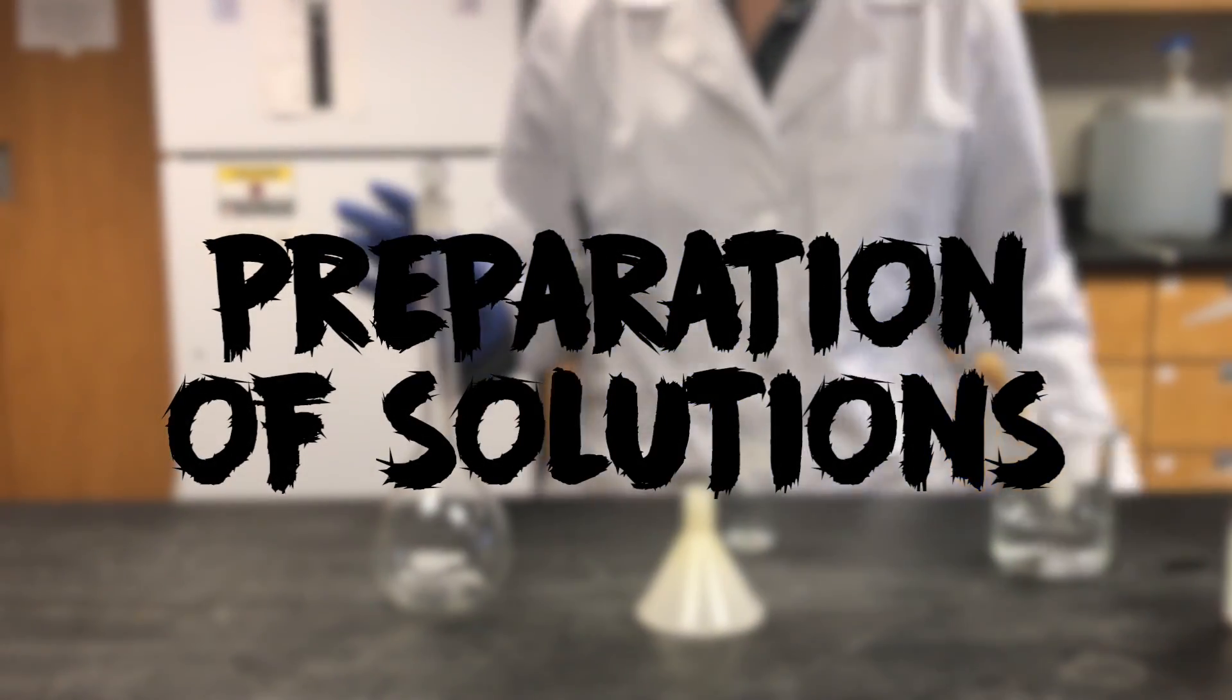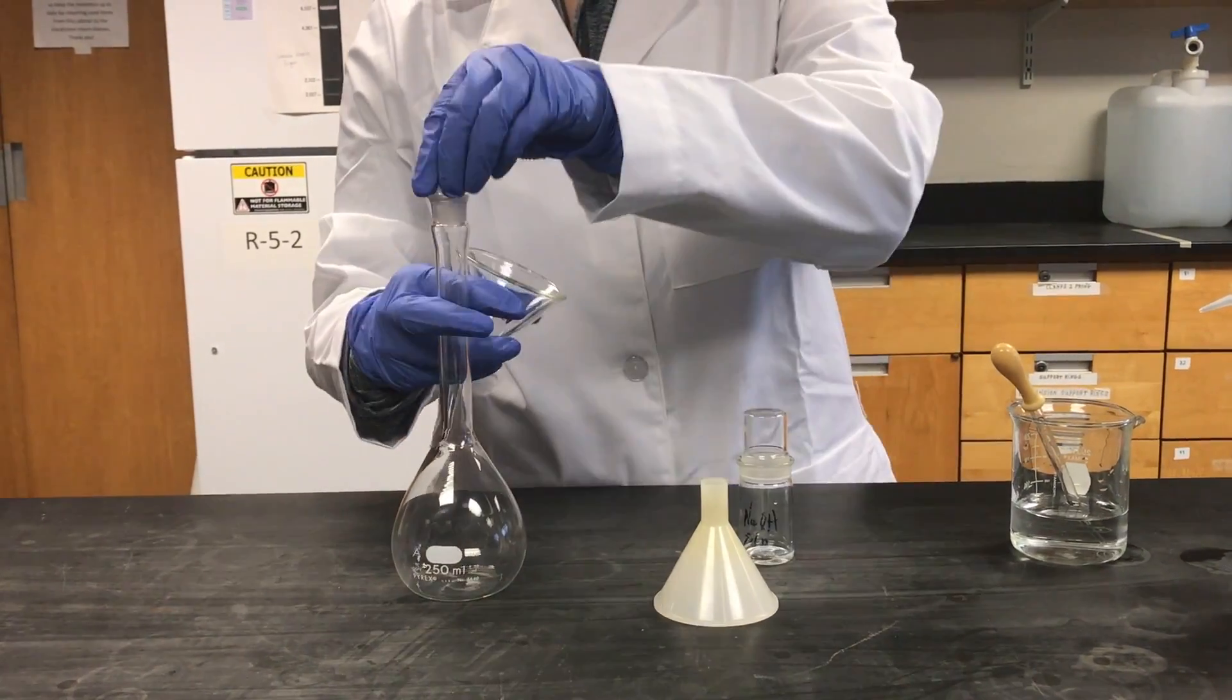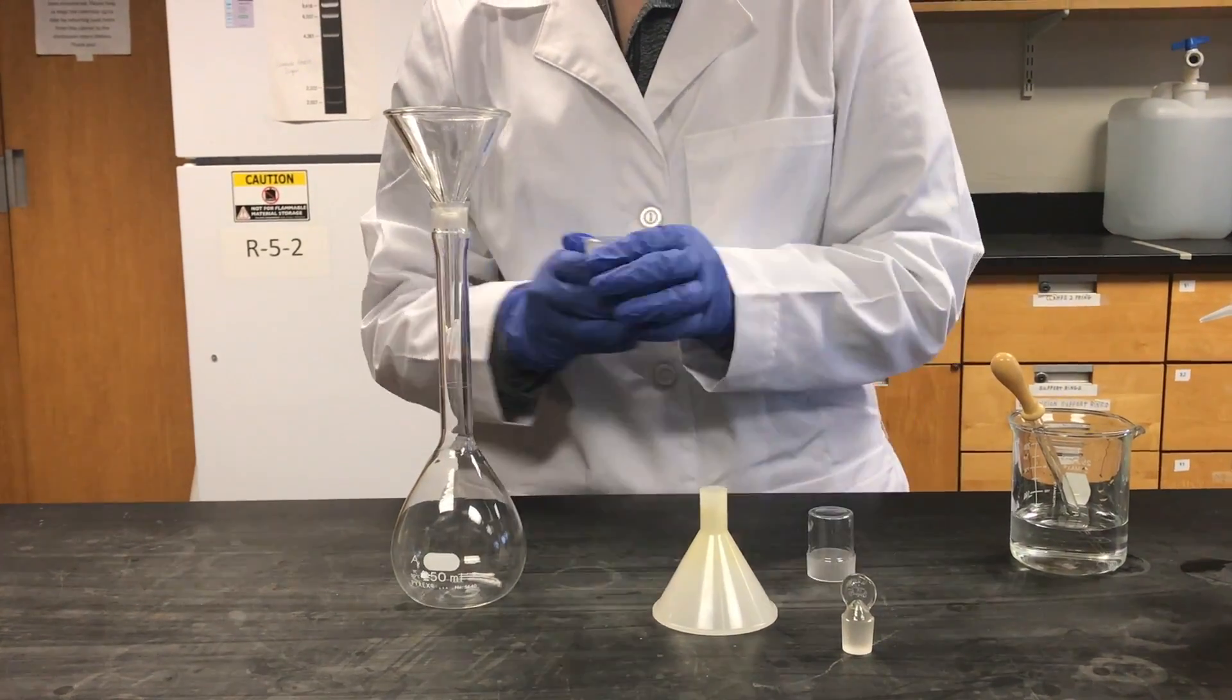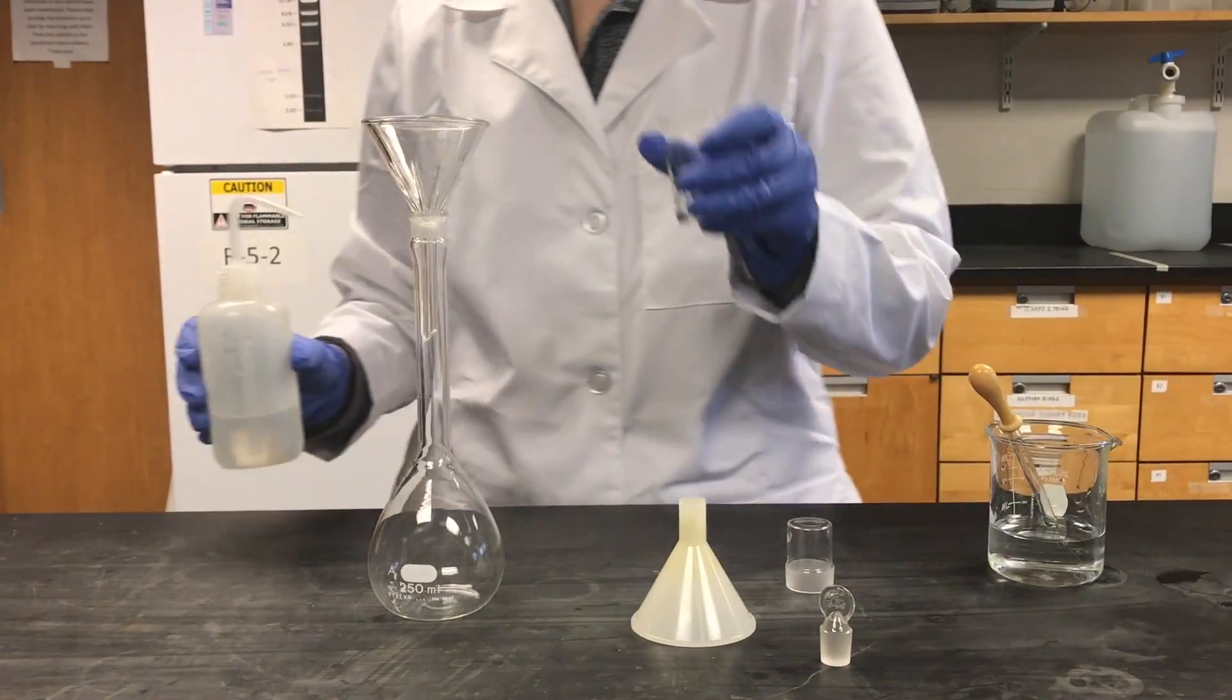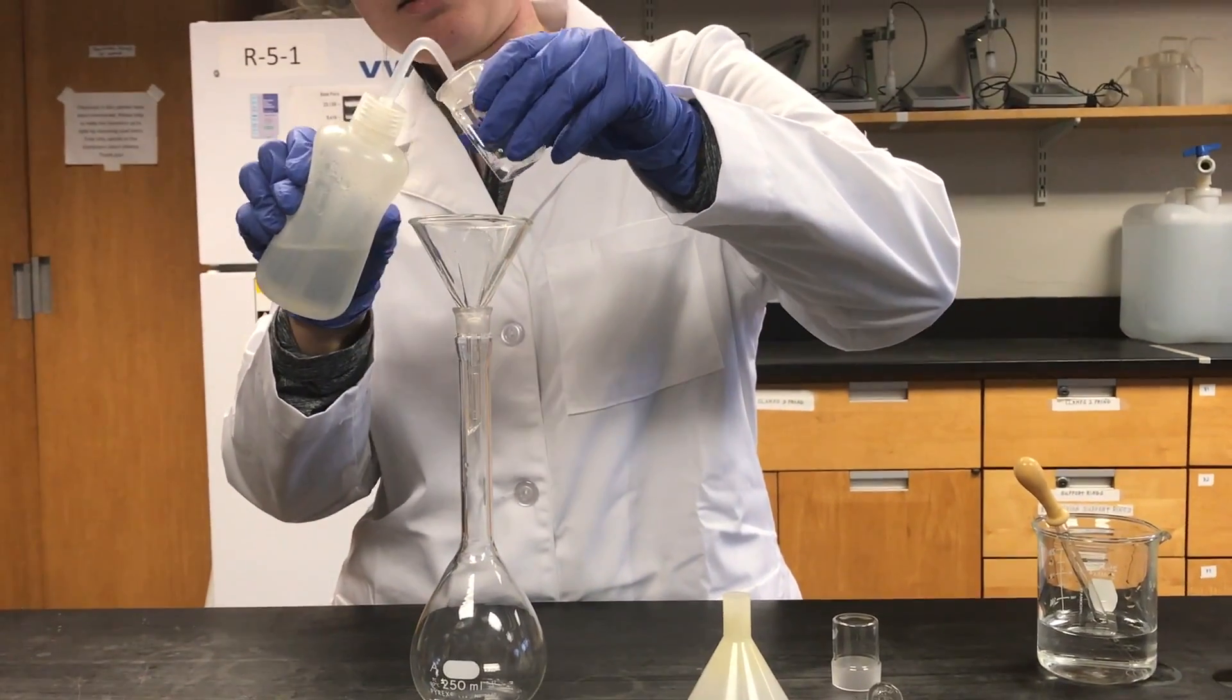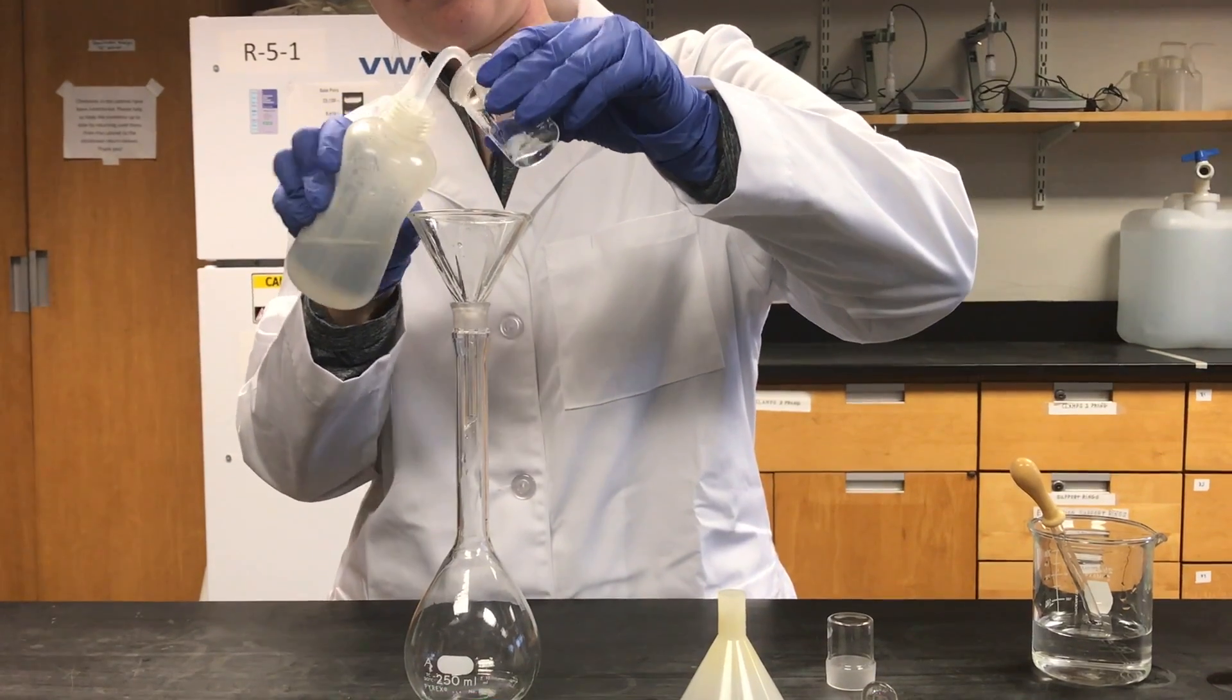Next, we're going to teach you how to prepare solutions accurately. For the transfer of liquid solution, you must place the glass funnel inside the volumetric flask and pour in your sample. And make sure to rinse out the weigh bottle with DI water to ensure all of the transfer.